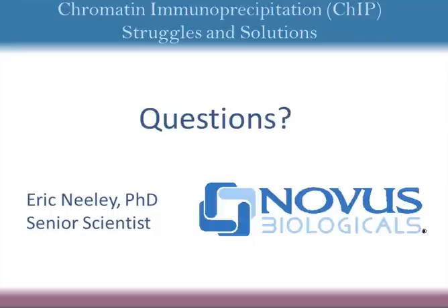The only thing that I always recommend to do overnight is the antibody incubation with your chromatin, but everything else can be done very quickly. Usually in less than a day and a half you should have results.